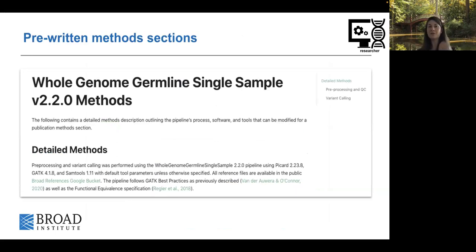So if you're someone who has been using our pipelines, we give essentially a template that people can pull into a publication that researchers are trying to get out, to make it easier to write up about the pipelines.